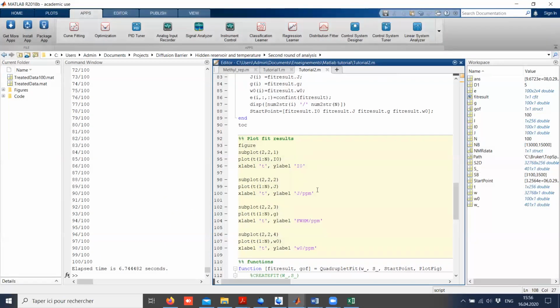So here I've displayed my data along time. What I can do to make it a bit nicer, I can use this error bar here. So errorbar does a plot also, but you have to give it X values, Y values, and the interval of confidence along Y. Sorry. So the first dimension corresponds to each spectrum.